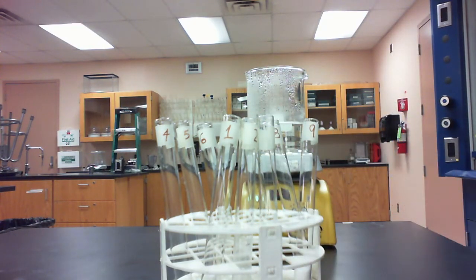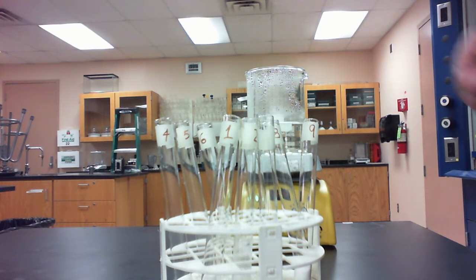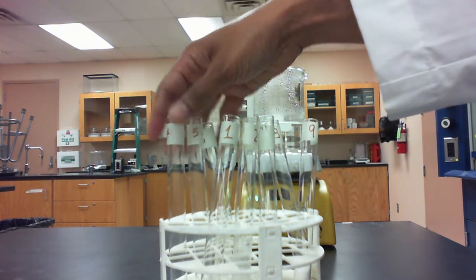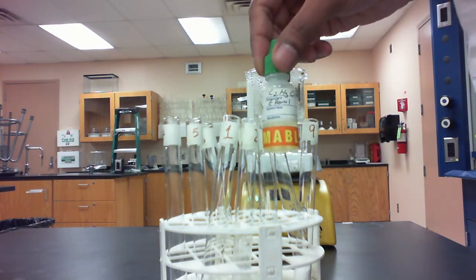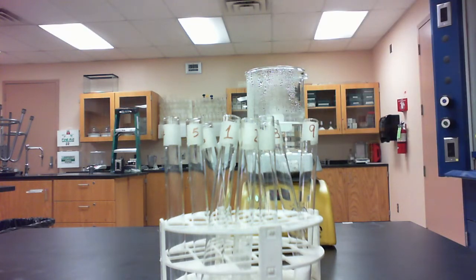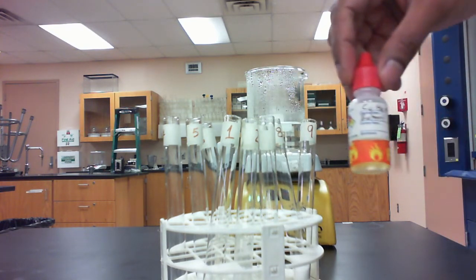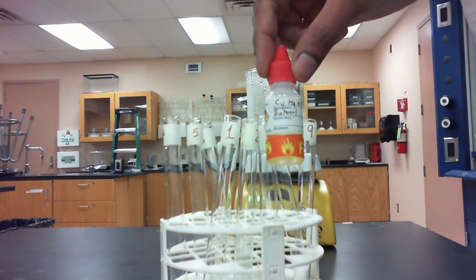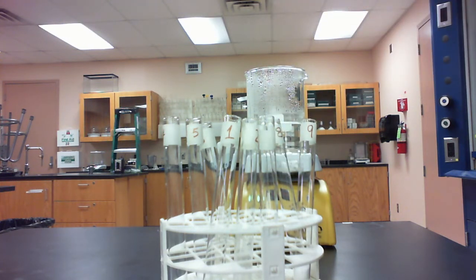What I'm going to do is to complete the addition of those alcohols in test tubes 4, 5, and 6. I'm going to add 1 milliliter of ethanol. And then in test tubes 7, 8, and 9, I'm going to add 1 milliliter of the third alcohol, which is butanol, according to the instructions in your lab manual.